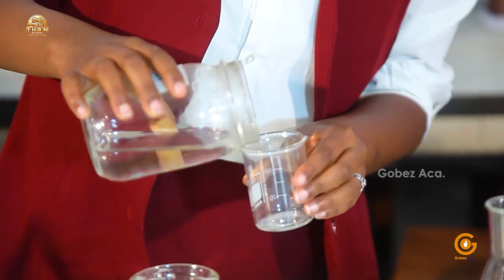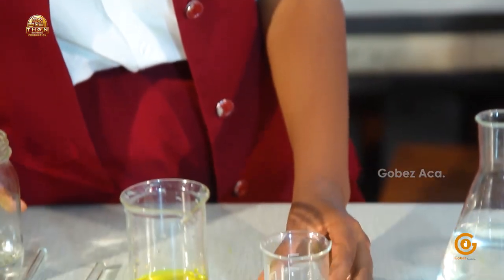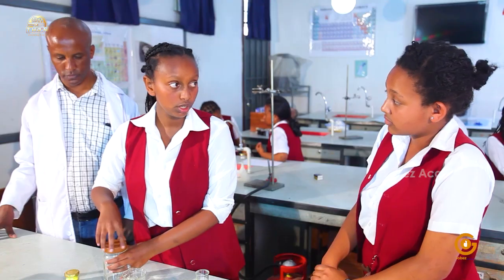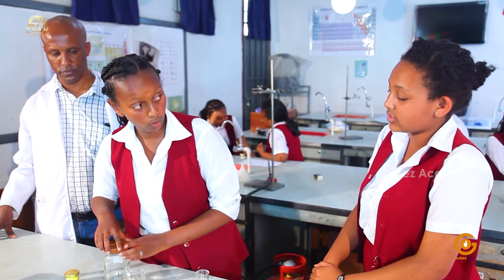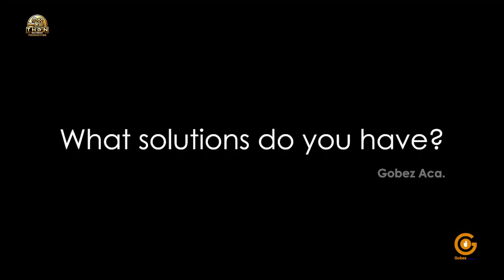And as you can see, hydrochloric acid is a colorless acid. So be careful when dealing with it because you might mix it up with other chemicals such as the water, because they are both colorless. So be careful when dealing with that.